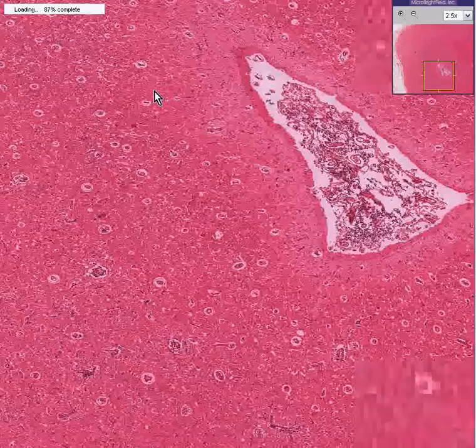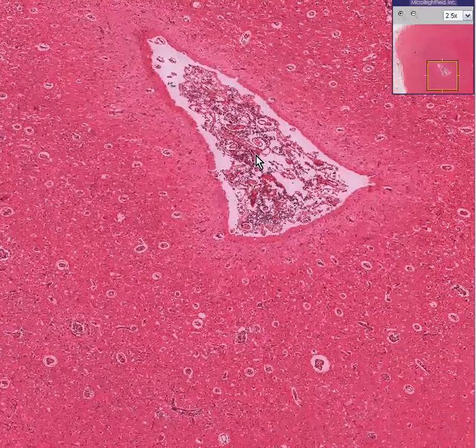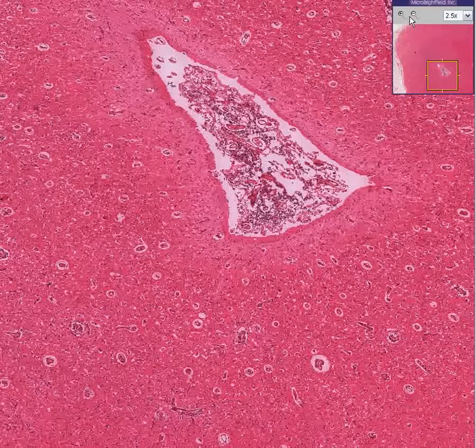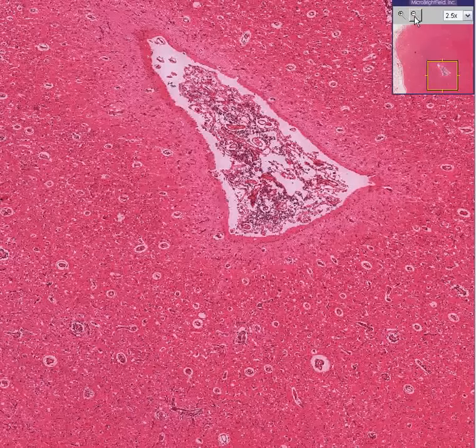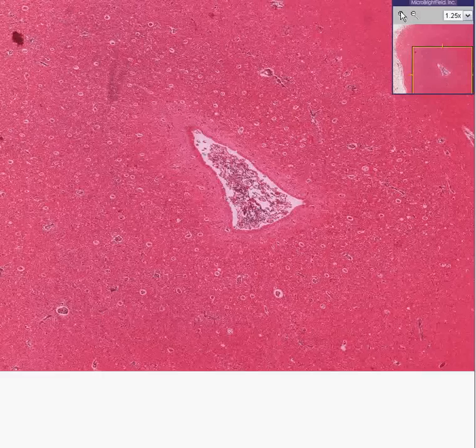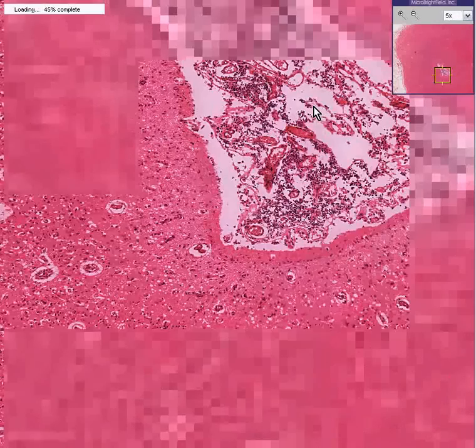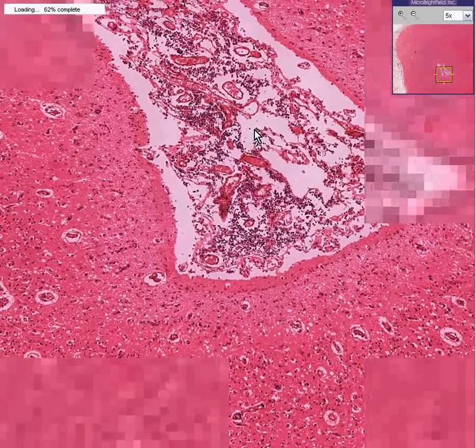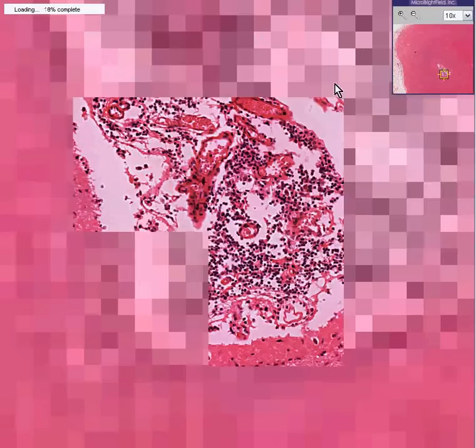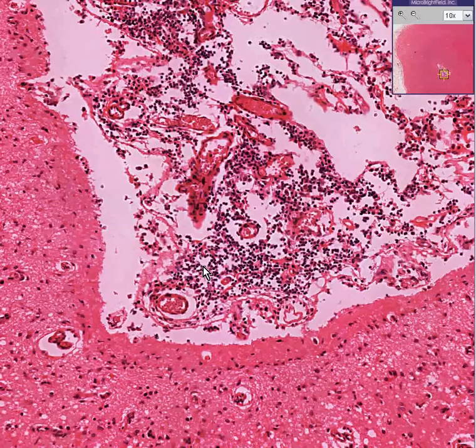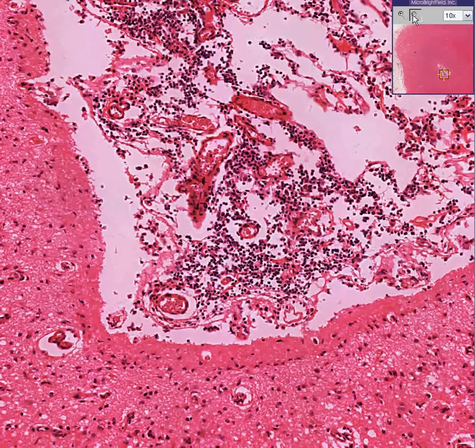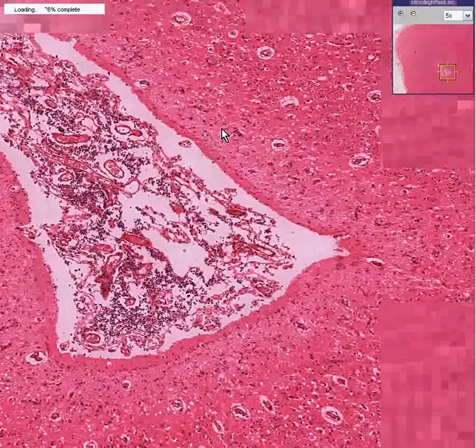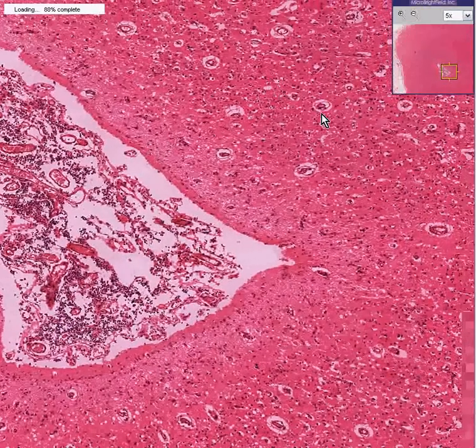In addition, you could see in part of a ventricle here, I assume it's a ventricle, because it's lined by ependymal cells, and there's a portion of a choroid plexus in it. You can see that there is some inflammation, inflammatory cells surrounding the blood vessels in the choroid plexus as well.